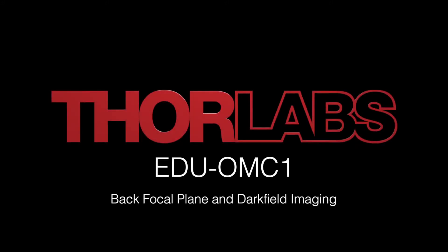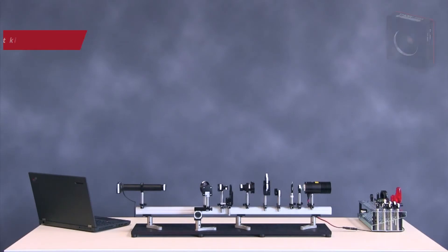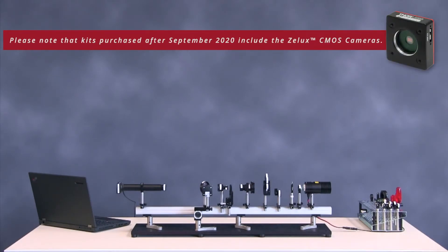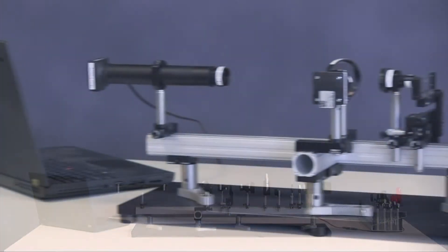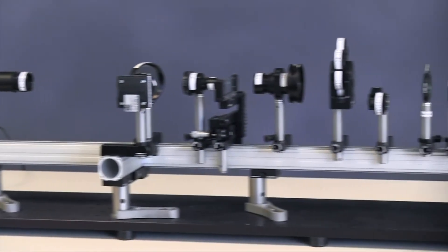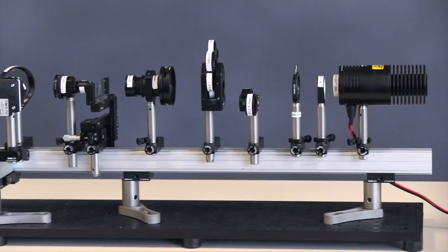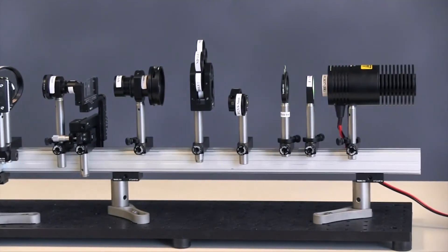This video follows the Kohler Illumination video and explains how to set up the color camera, also known as the back focal plane camera. This video also shows how to achieve a dark field image with a zero order mask.